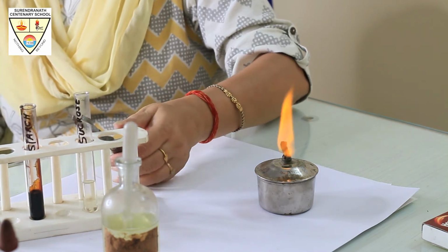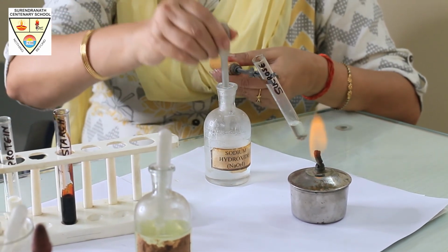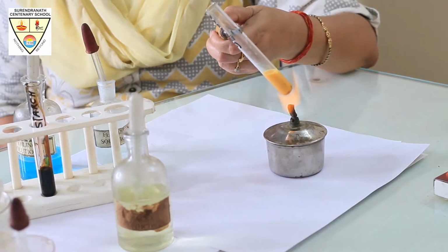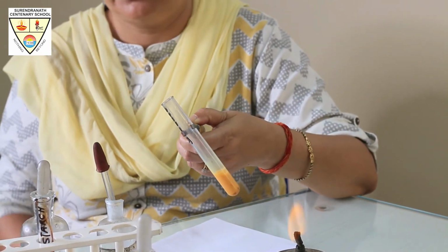Let it cool, add NaOH to it, let it cool, and then follow the same procedure as you have followed for monosaccharides. You will get the same orangish yellow precipitate. This is a confirmed test for disaccharides.